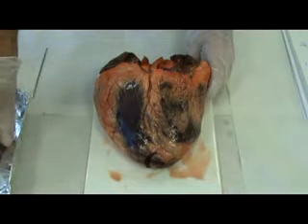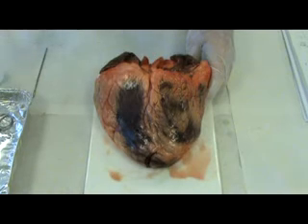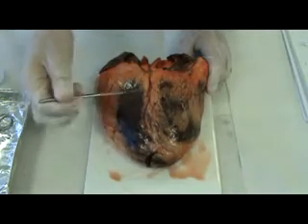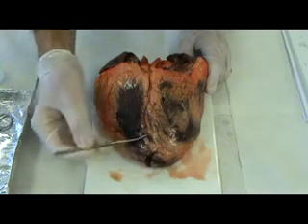We can use a probe to have a look at one of the branches of the coronary arteries, the interventricular branch, and on this posterior view of the heart, I've already made an incision at that point.